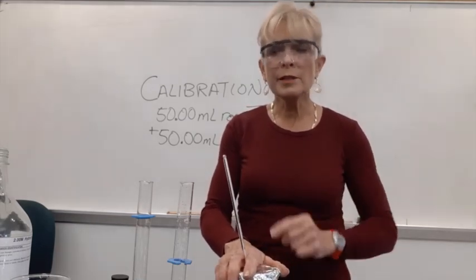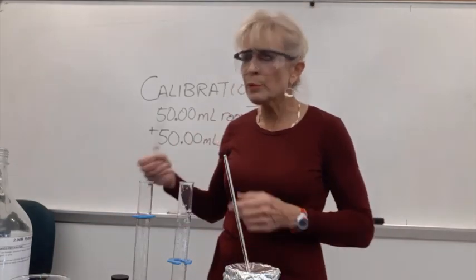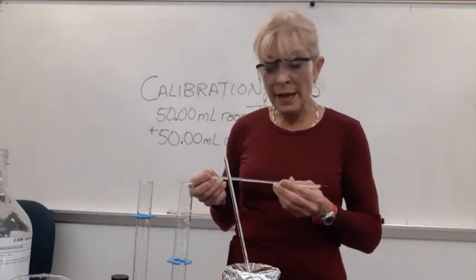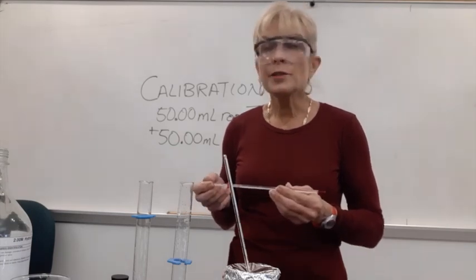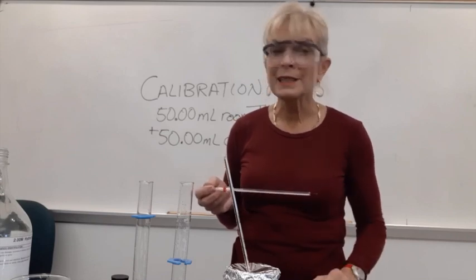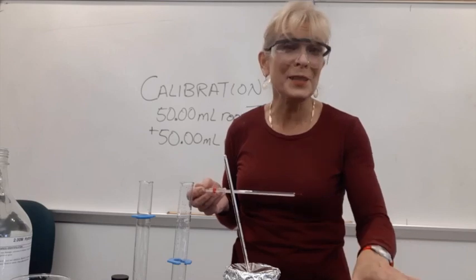There is one additional temperature that needs to be taken, preferably around the time that you're doing the calibrations. And that is just simply room temperature of the air. Okay, so that is the end of the experimental video. And you'll get a separate video of calculations.